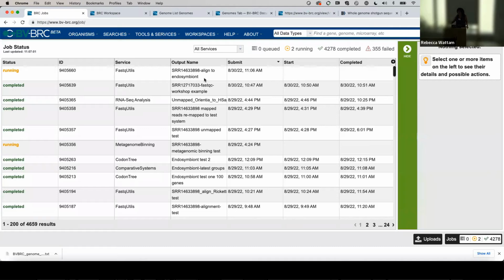Question. You wanted to confirm that the target genome that we used was the reference genome that we're mapping to. I just want to distinguish between references and the GenBank references that Malik talked about earlier. In this case, it's whatever reference you choose it to be.